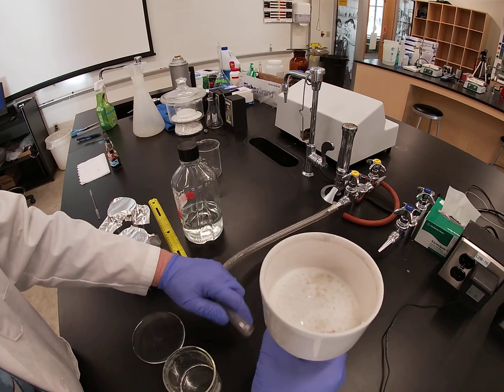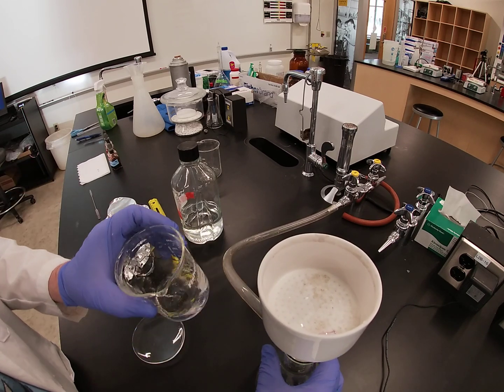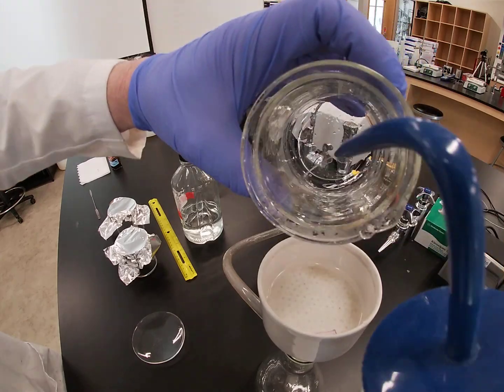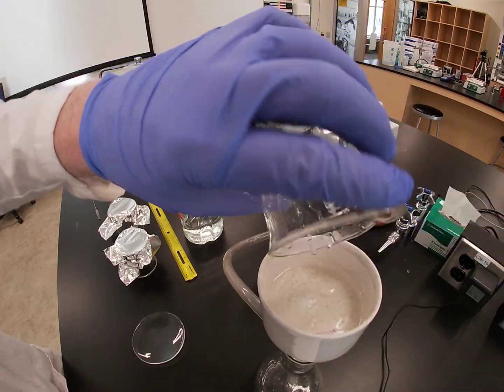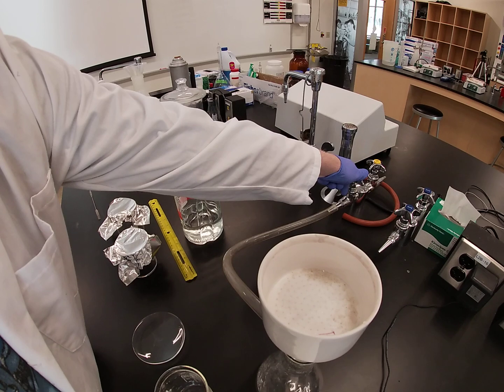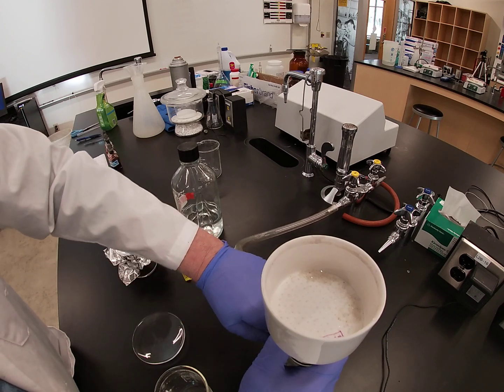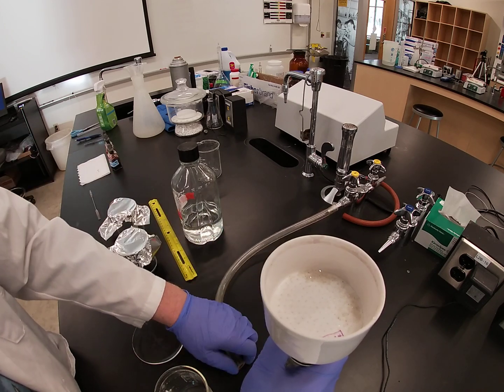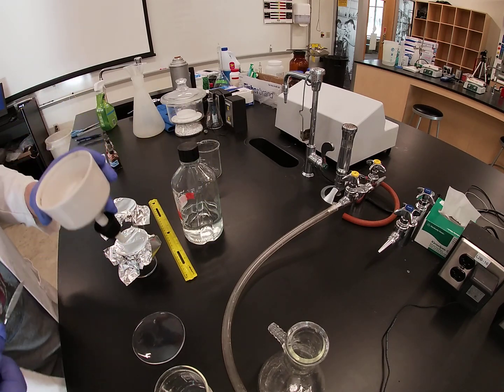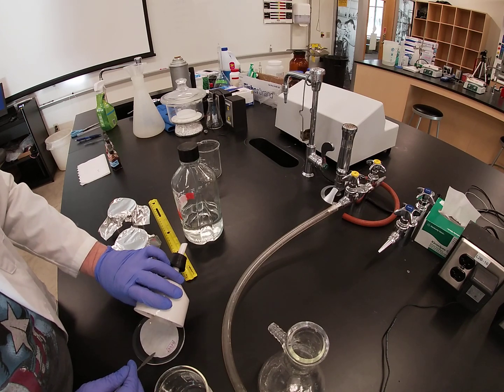We have filtered once. We're going to throw this system back on, and in an effort to get more of anything that's in that beaker out, we are going to filter again. And then we're going to take our filter paper out and slide it on what is known as a watch glass.